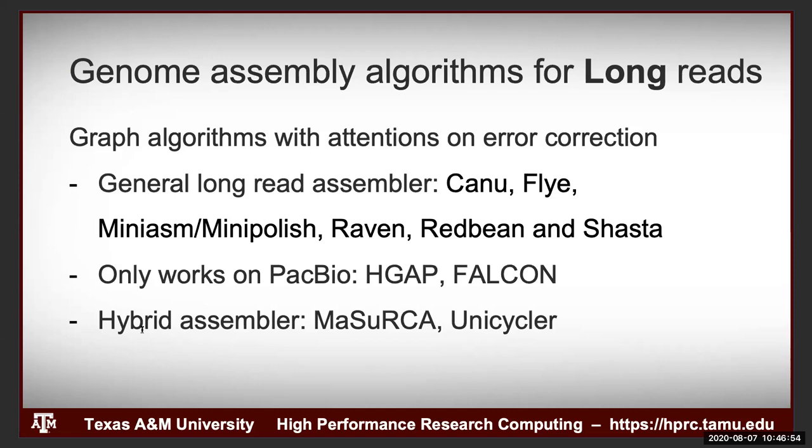And if you have both, like if you have short read and long read, you can use some hybrid assemblers like MaSuRCA, Unicycler, those tools. So those are nice tools. And I personally have tried Canu and Flye and MaSuRCA and Unicycler.